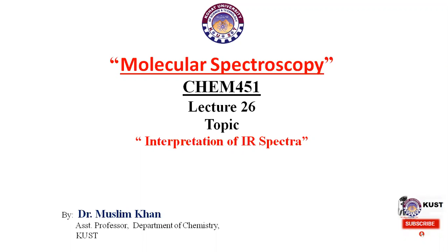Today, the topic of our presentation is interpretation of IR spectra. And today is lecture number 26. Course code is CHEM451, and we are discussing getting some information from IR spectra and molecular spectroscopy.